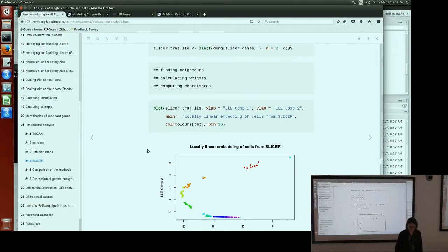Okay, hopefully all of you have got a chance to try for yourself that if you change the k here to 5, you should see a plot with only a couple of points on it, each a different color, because essentially what's happened is that all the variation within each time point has been eliminated, and you're just capturing the differences between the time points. So each red dot is overlaid on every other red dot, every red cell in there. So it's very important to choose the right K for this method.